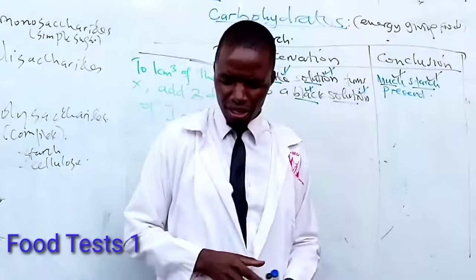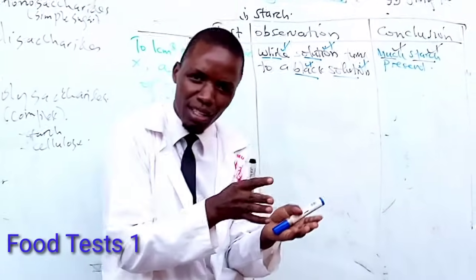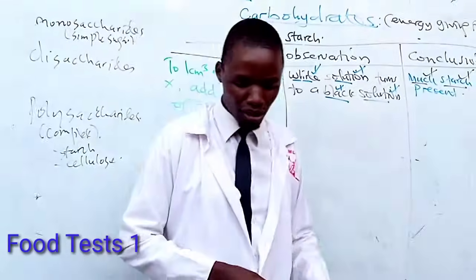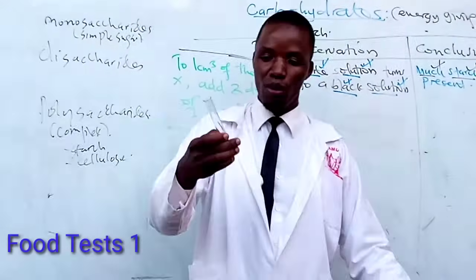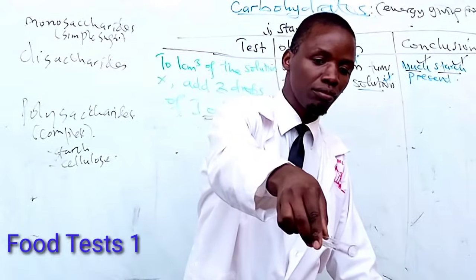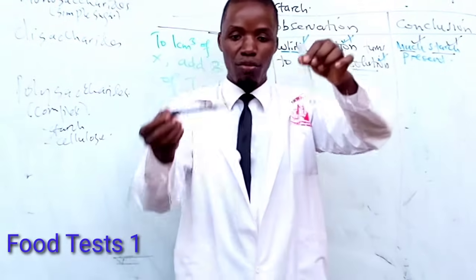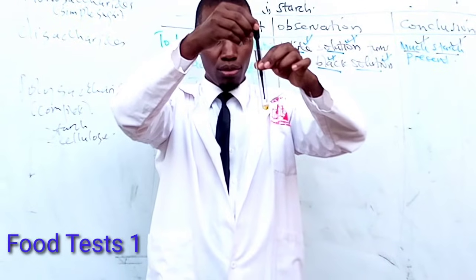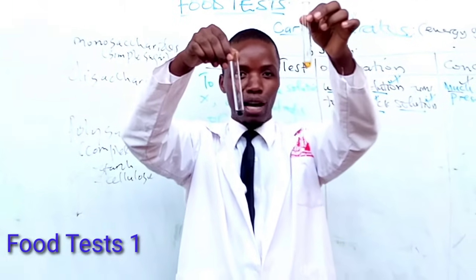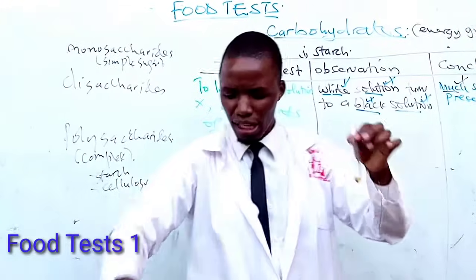What if I don't have any starch? Let me use a solution that is just water — we don't know if it has starch. I add iodine to it — one, two, three drops. When you compare these two test tubes, you can see this one is black, but this one has remained brown. So in this case, starch is absent. When you add iodine and the solution remains brown, it means there is no starch.